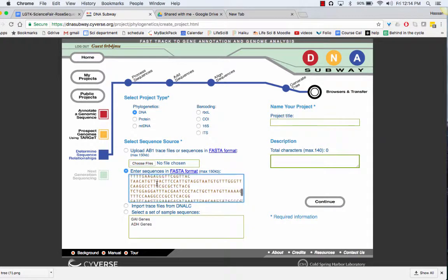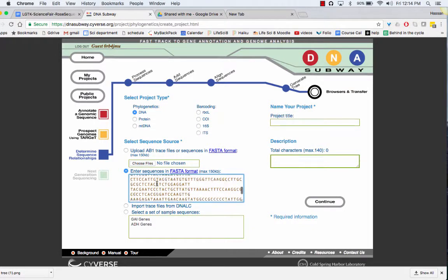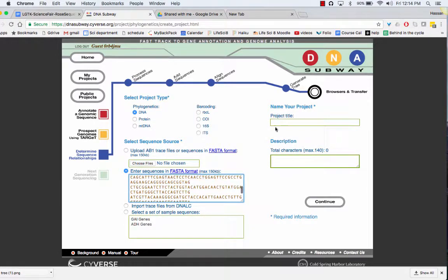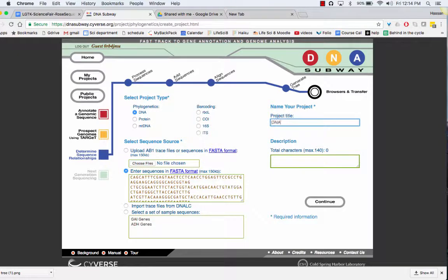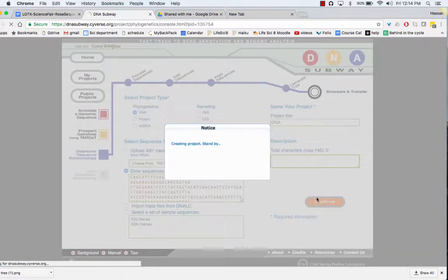I'm going to scrub it just to show you the DNA sequences. Give it a title and press continue.